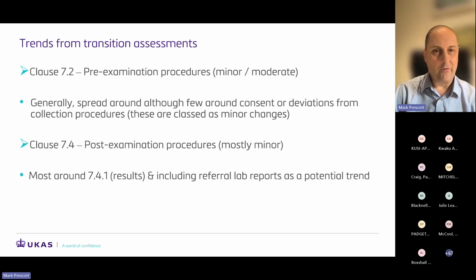Similar with clause 7.4, which is the post-examination procedures. These are also minor changes, but most of the non-conformities that we're seeing here seem to be falling within 7.4.1, which is about reporting results. There is a potential trend here about the reporting of referral lab reports, especially when they're included within routine laboratory and in-house tests.